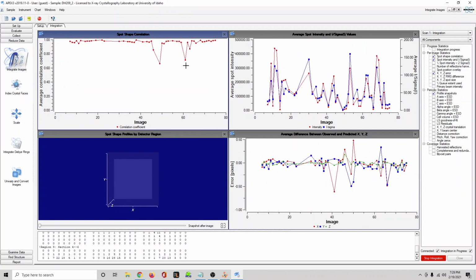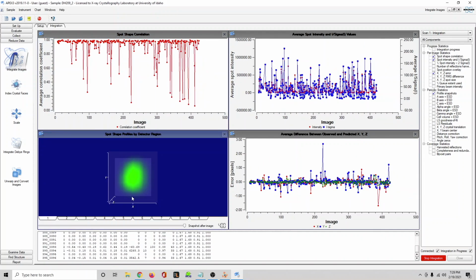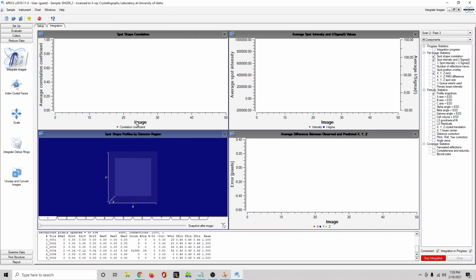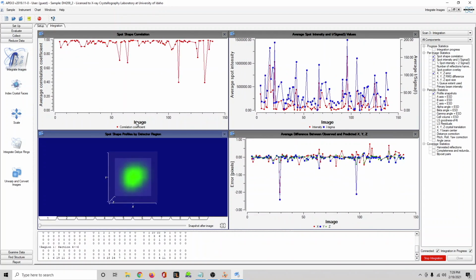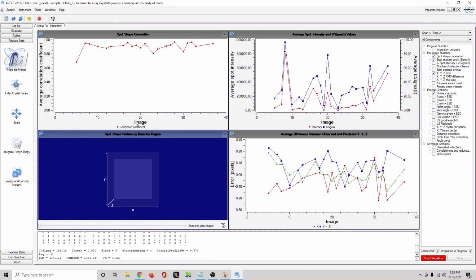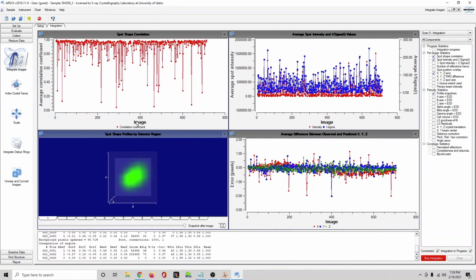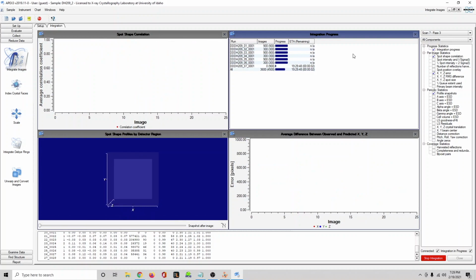And so far it's looking really good with our spot shapes. And they're a little bit oblong in the vertical orientation because the spot shapes are essentially the reciprocals of the crystal dimensions. That's one of the contributors to the reflection shape. Other things can be unit cell twinning and mosaicity, which is the dispersion of the unit cell parameters of the macroscopic crystal. But that is one thing. So yeah, we'll see how this goes.